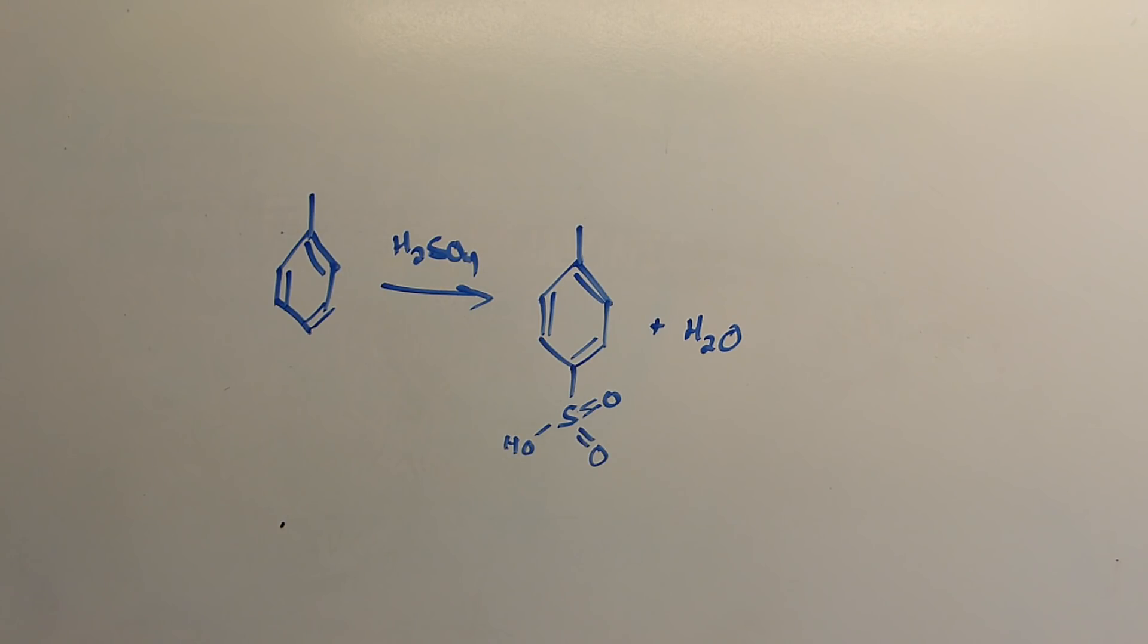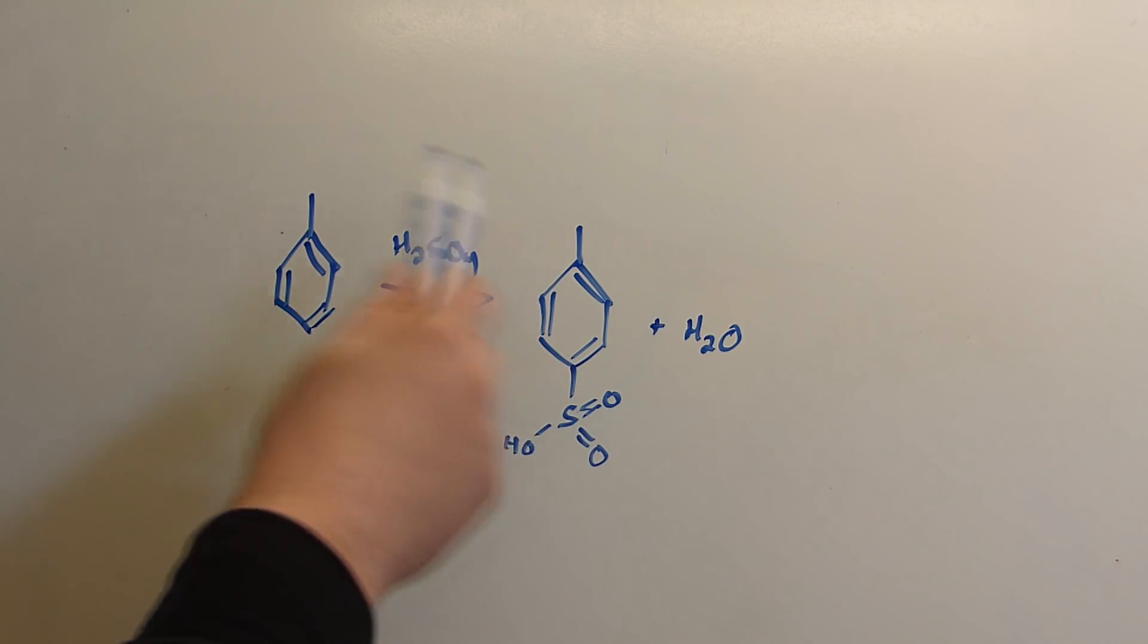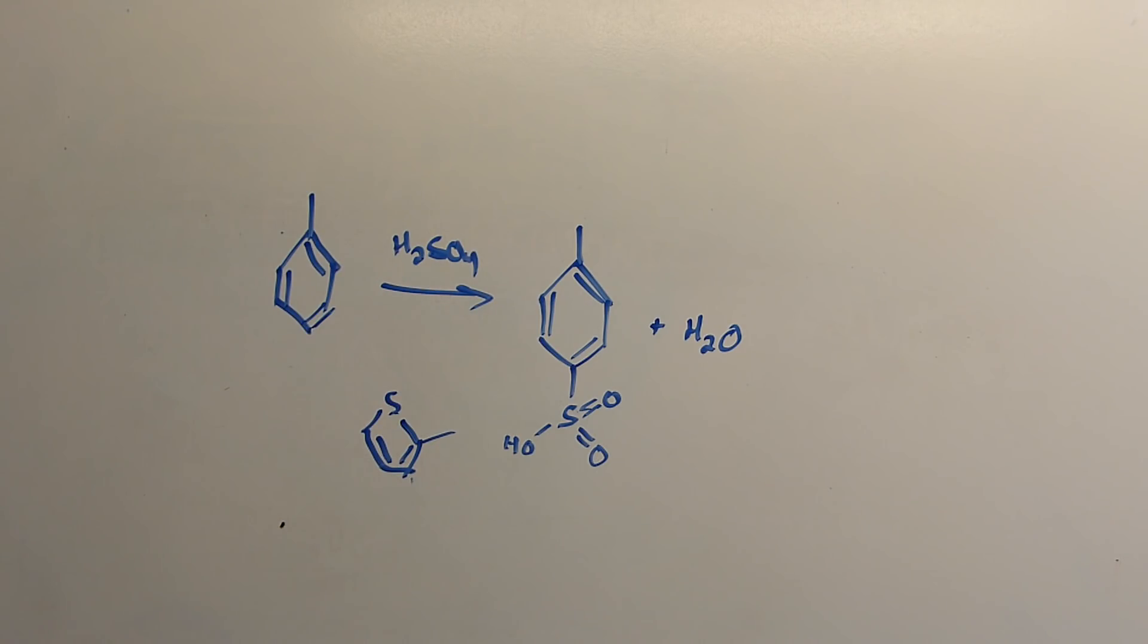Before I get started I'm going to have to perform a purification step on the toluene. Commercial toluene is distilled from petroleum products and often contains sulfur byproducts. Several will remain with the toluene because they have boiling points very close to that of toluene. The one of particular interest today is a compound called methylthiophene. Thiophene is a five-membered heterocyclic ring with sulfur in it and there's a methyl group. This methylthiophene will start to polymerize and discolor our sulfonic acid when we reflux it.